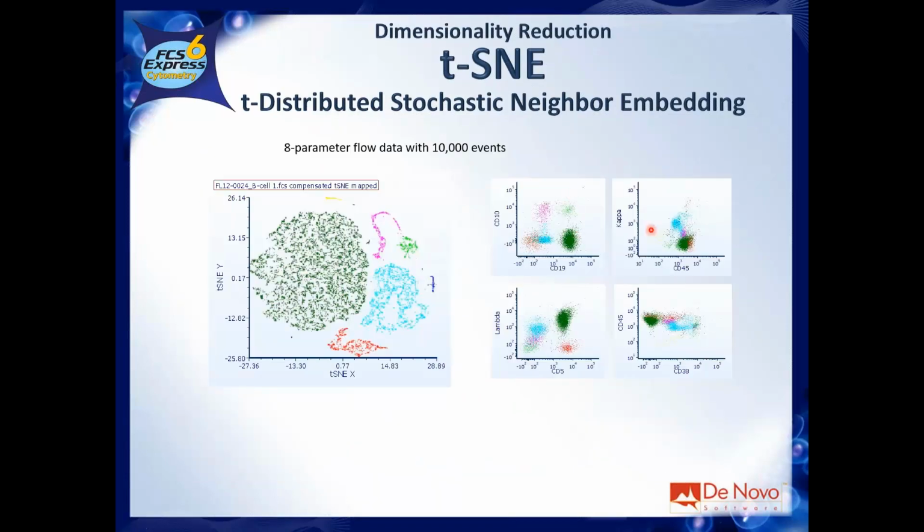This is just an example of real data. You see different parameters, and this is the tSNE plot against X and Y. I usually suggest to look at this tSNE plot like a map. You see you have different clusters, different highlands of data. Those are all different populations.